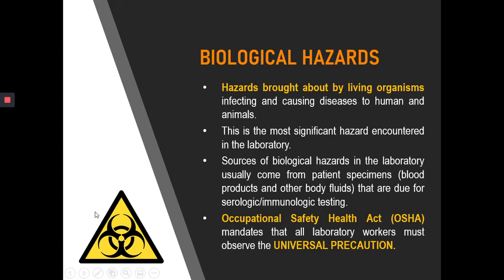So this is our biohazard symbol. Biological hazards are hazards brought about by living organisms. These living organisms can infect both humans and animals. The most common source of biological hazards in the laboratory are patient specimens, usually in the form of blood products and other body fluids like urine, cerebrospinal fluid, seminal fluid, pleural fluid, and the like. These specimens are due for serologic or immunologic testing.